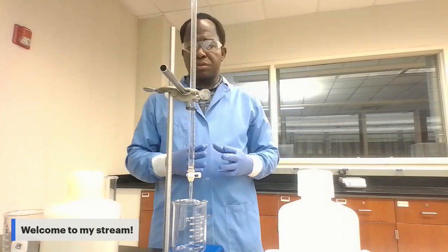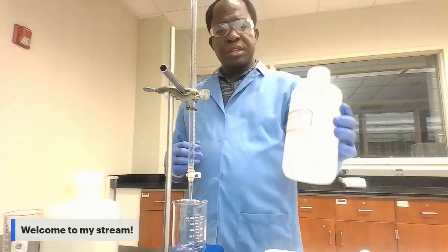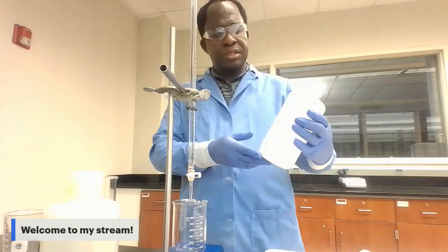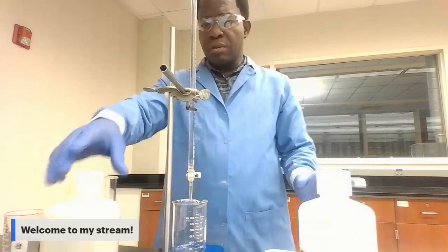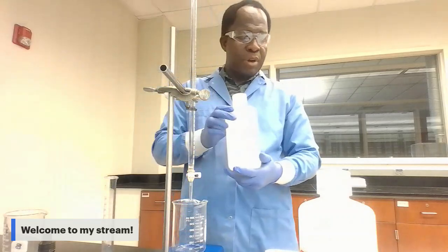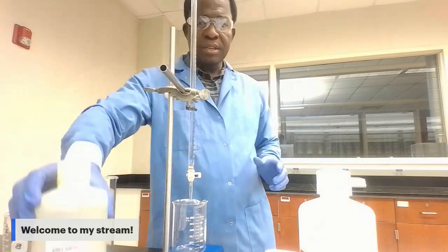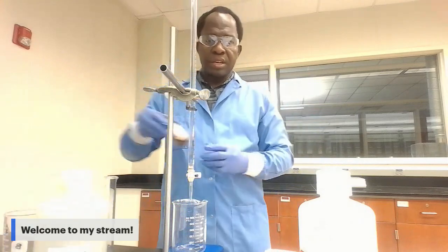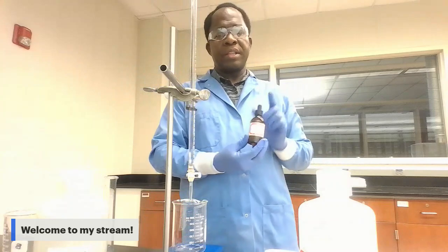Now, to do this lab, you need a saturated solution of Ca(OH)2. You also need 0.05 molar hydrochloric acid. You need phenolphthalein, which is a color indicator.